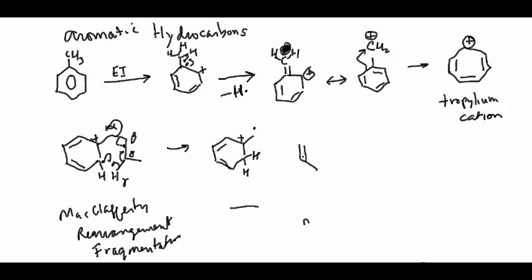All right. So this is an example of this McLafferty type rearrangement fragmentation.